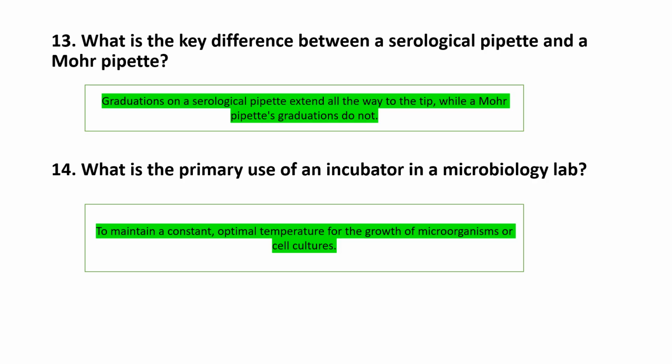We incubate for 48 hours, right? So when we incubate for 48 hours, then we read the plate. So incubation is very important to maintain a constant optimal temperature for the growth of microorganisms or cell cultures. That is our answer here.